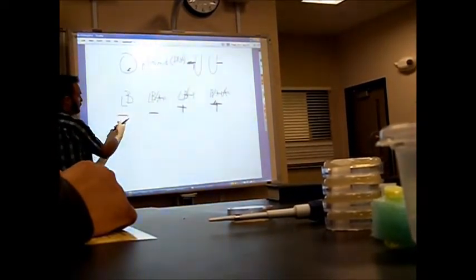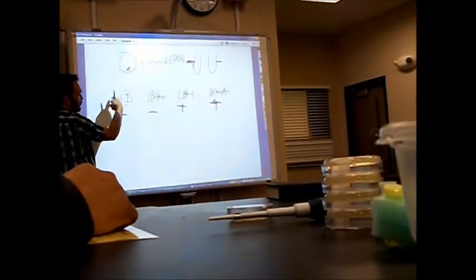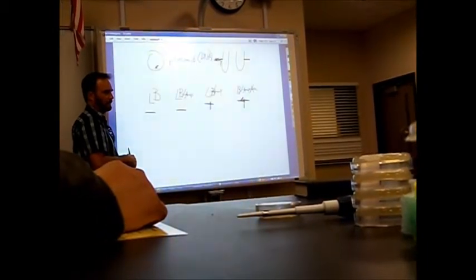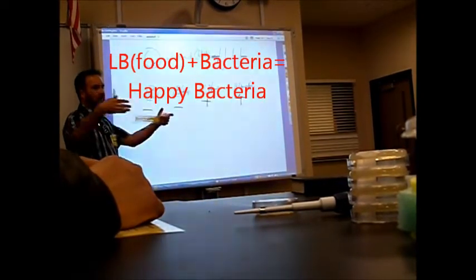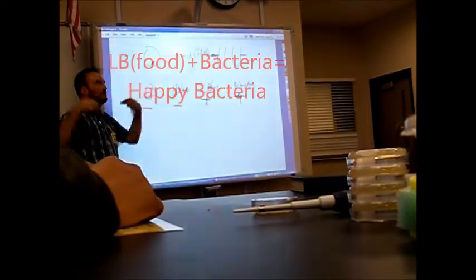What do you think is going to happen here? So these are bacteria that didn't get the plasmid DNA, and they're just growing on regular old food. Are they going to live or die? Die. Oh, they die. They're on LB as food. Oh, yeah. They're going to be happy as could be, right? You're going to have a little lawn. You won't even see individual colonies. It'll be a whole little lawn. It's just happy bacteria living on food.